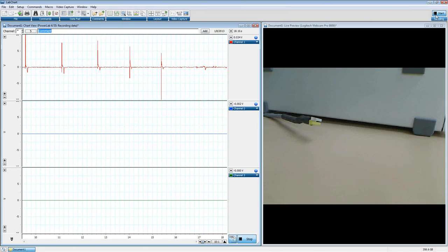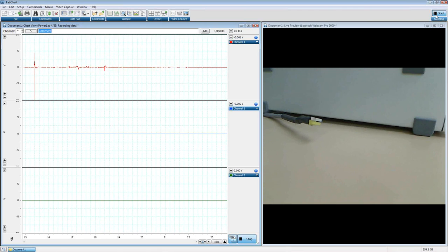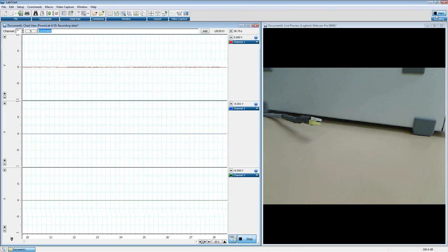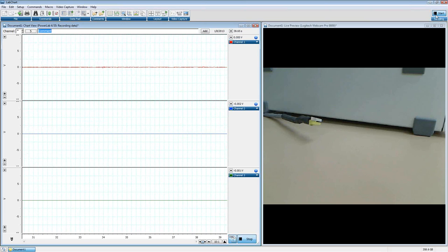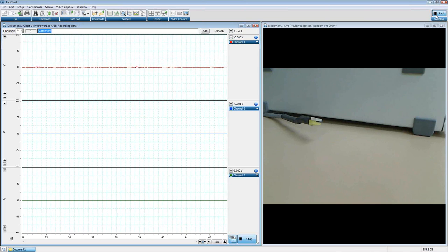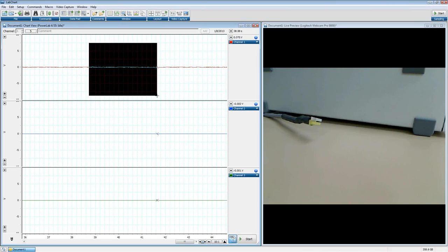So those are the basics of digital inputs and outputs, Event Manager, fast response, and communicating with other devices in your lab and kind of bringing their inputs into LabChart, into the data, marking it, or actually telling LabChart when certain conditions are met to tell the PowerLab to send out a TTL pulse to signal another device to either take an image, to inject a certain volume, things of that nature. So it's a great way to automate your lab and kind of bring everything central to LabChart. So you don't have to do a bunch of different setups. Everything can be here in a LabChart file, in a settings file that you're going to use every time, or just for you to create on the fly.